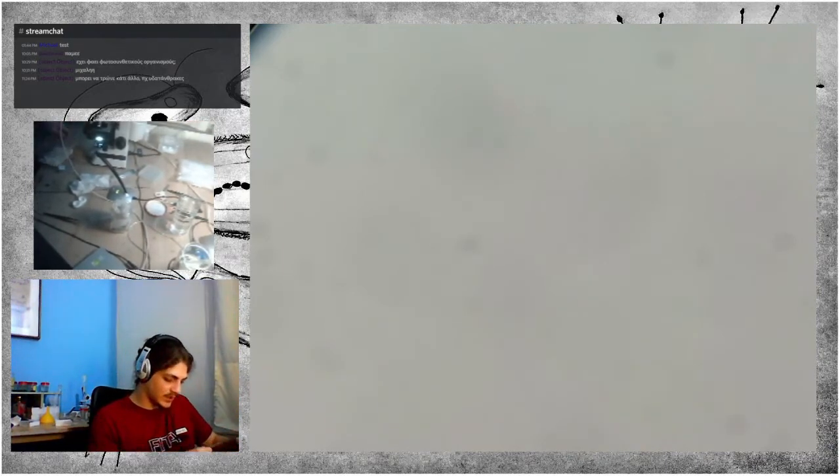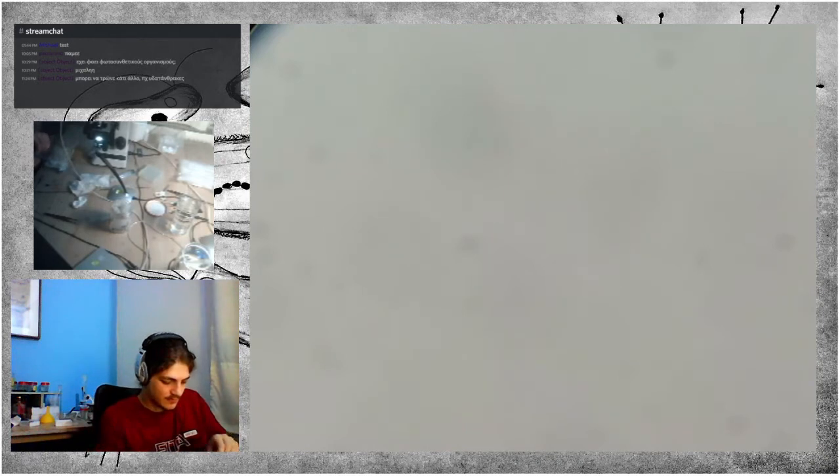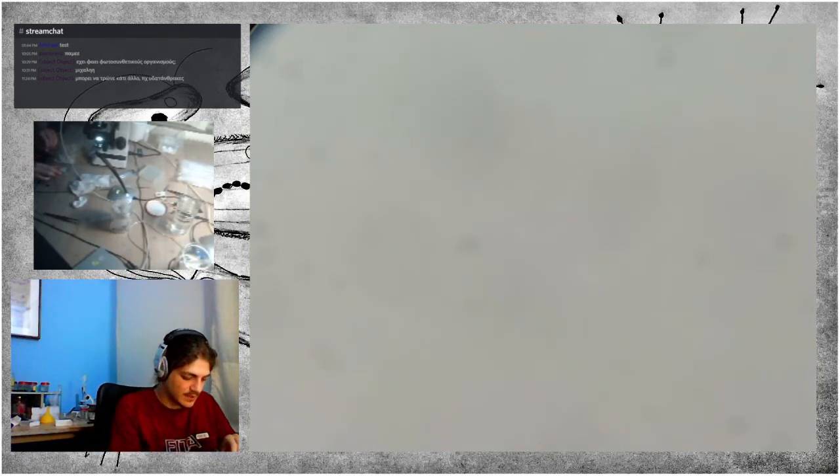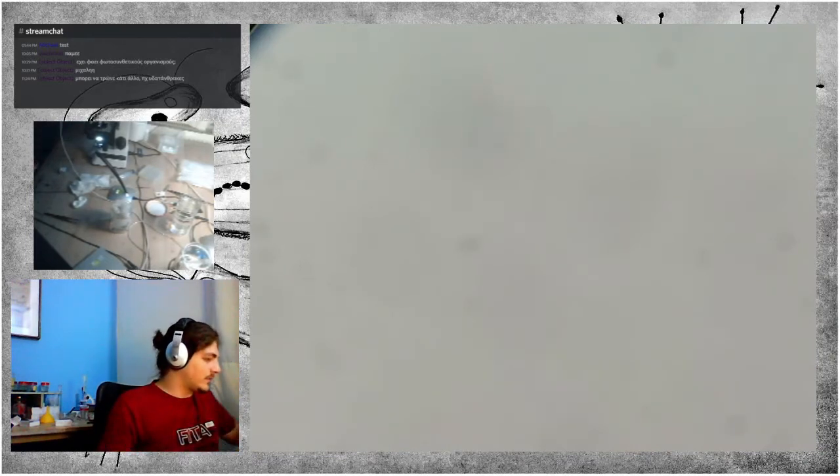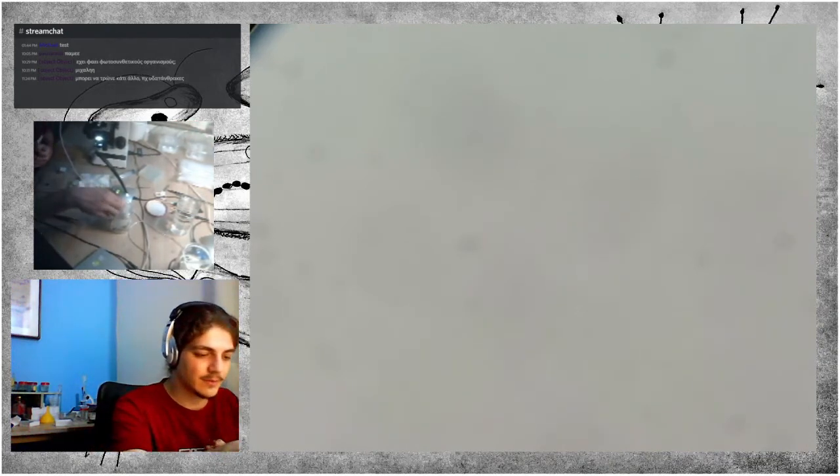Again, I'll be storing them for later observation. I think we're going to look at another slide, and then I'm going to call the stream off because it's getting late here. Let's see.